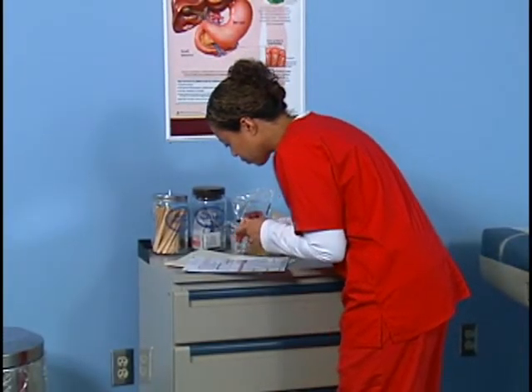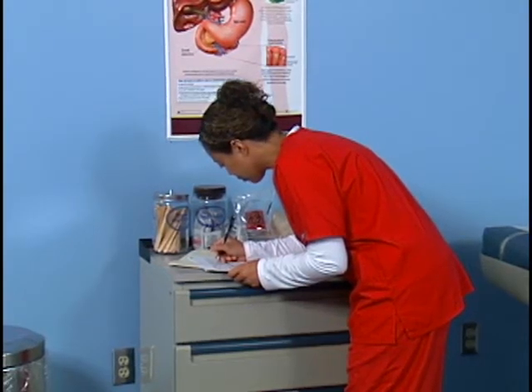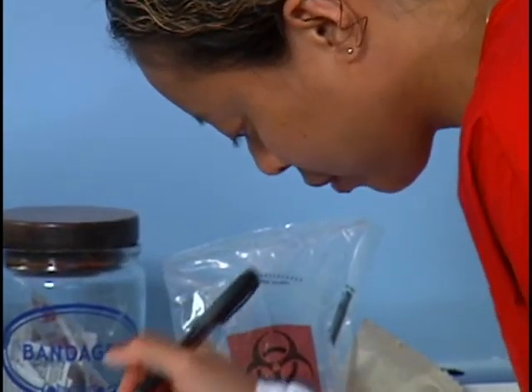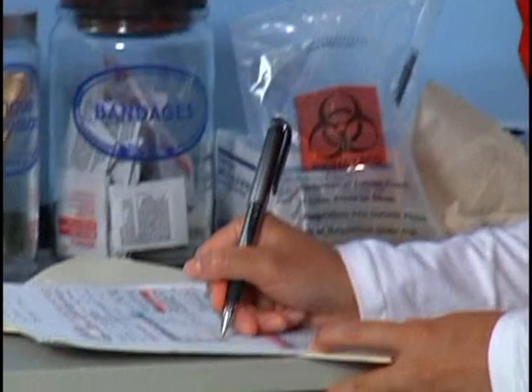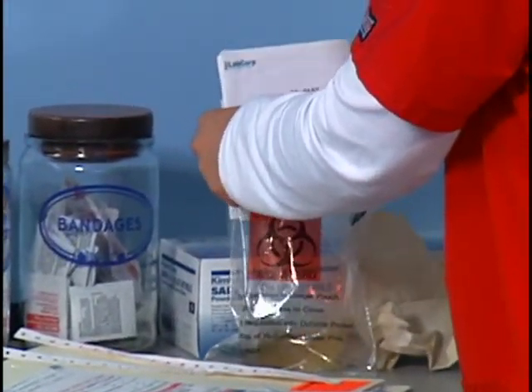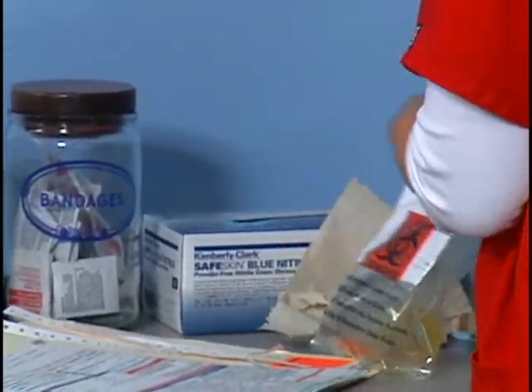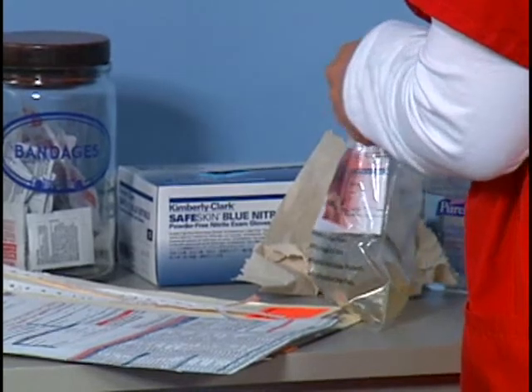The urine specimen is being sent to an outside laboratory for culture and sensitivity. You must complete a laboratory request form to accompany the urine specimen. Place the urine specimen and the request form in a biohazard specimen bag. Preserve the specimen by placing it in the refrigerator for pickup by a lab courier.